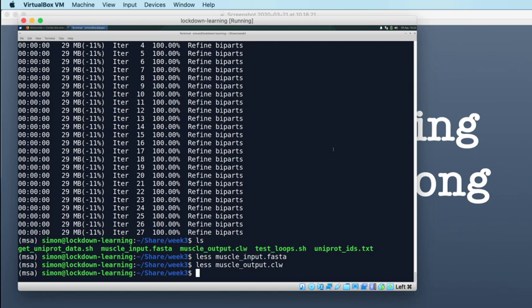It's not a command line tool, so unlike pretty much everything else that we've used so far, you can't work with it at the command line, but you can launch it from the command line. We can run it as a command, and it will open a graphical user interface containing Jalview.